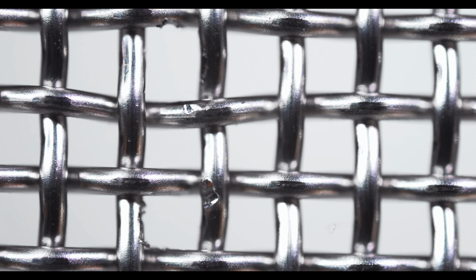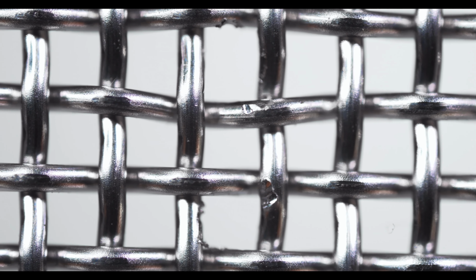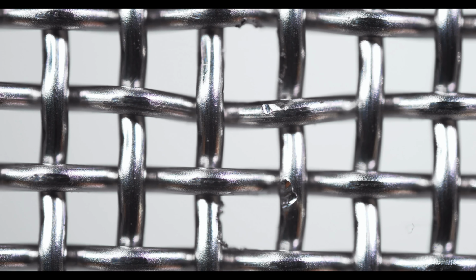Sieve cloth mesh is woven using identical techniques as industrial textile weaves. This means that blemishes that happen during the weaving process can ultimately affect the reliability of your test sieve analysis results. For instance, if a particular aperture or pore opening is smaller than intended, then odds are one of the apertures in the proximity is larger than intended. Because of this, tolerances have been put in place to standardize a specific level of statistical precision.